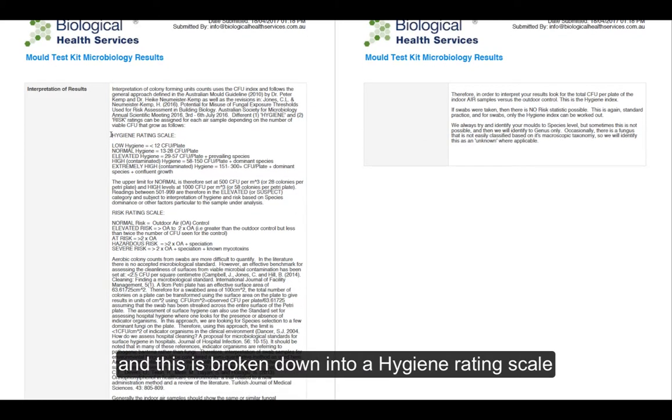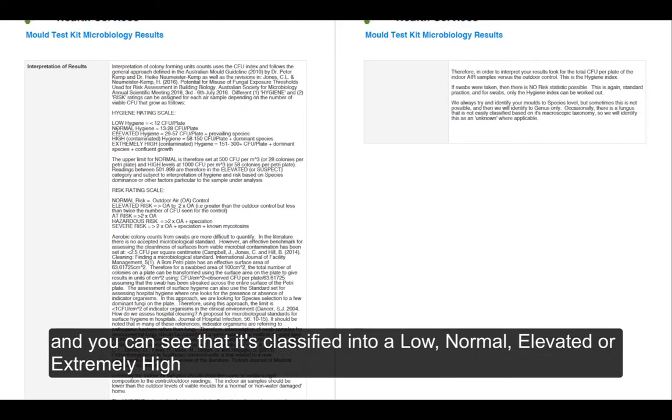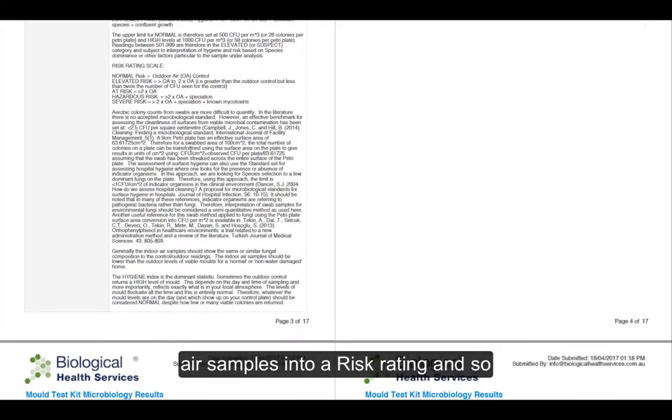This is broken down into a hygiene rating scale, and you can see that it's classified using a low, normal, elevated, or extremely high level of contamination. This also translates for air samples into a risk rating.